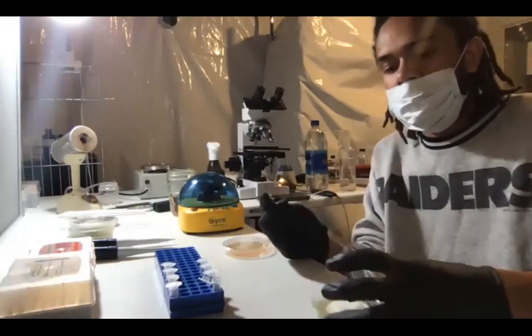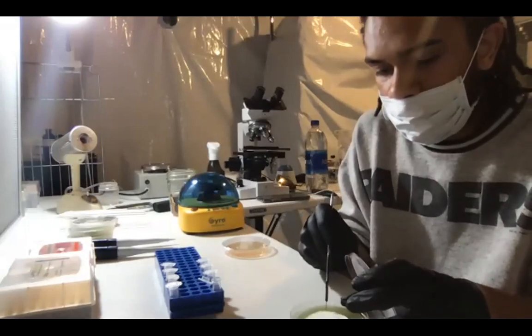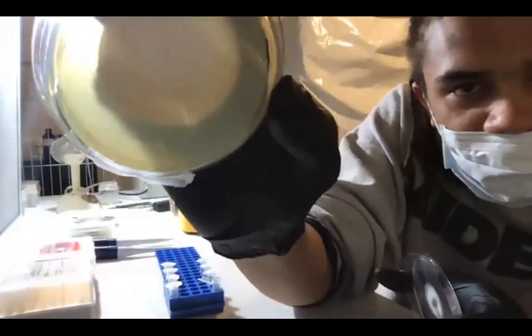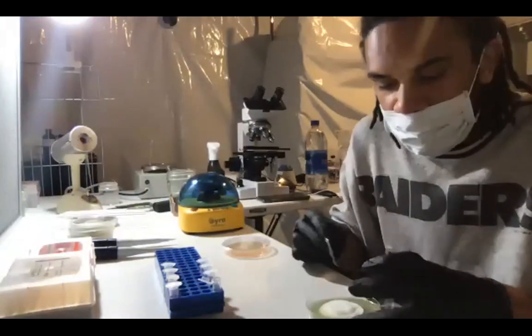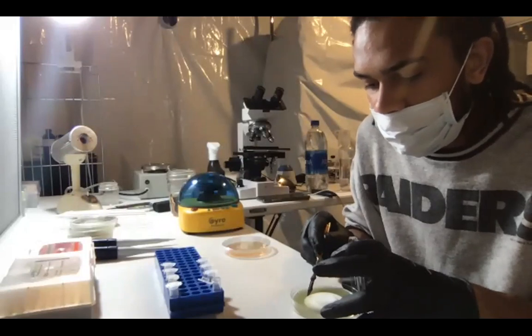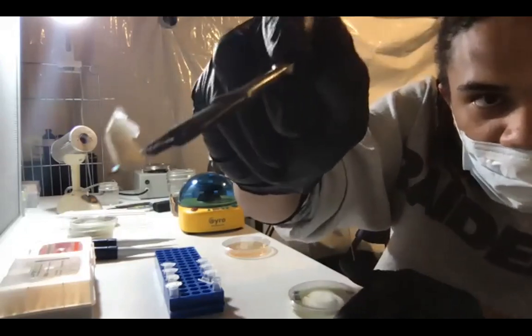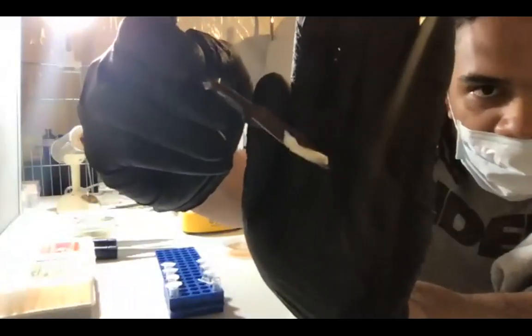And I'm going to go in here, and I like to do this from the edge and cut two lines. I'll show you up close. And kind of make it like a rectangle. So you can see, it might be a little bit hard to see, but I cut like a little rectangle on the edge. And what you're going to want to do is gently scrape the top. You want to get a little bit of the agar so you don't destroy the mycelium, but you don't want too much agar because it can mess up your reaction. So there, I have a little piece. I didn't dig up the whole agar with it. Just a really tiny top layer of mycelium and a little bit of agar.